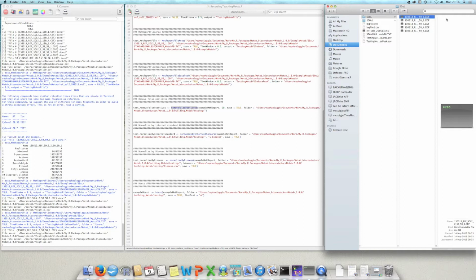So the ideal way would be to go back to the chromatogram and check in the samples where that compound was not found to see if that compound is actually there, and even check in the sample where that metabolite was identified if the identification was correct. However, we are not going to do that for every metabolite.